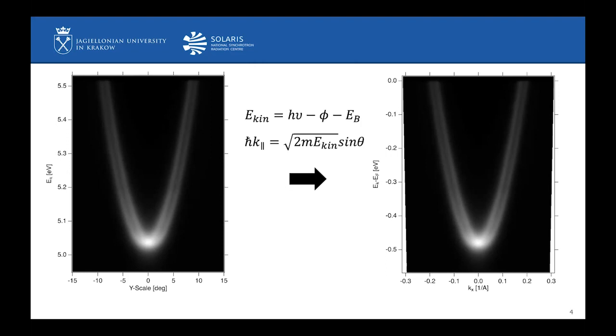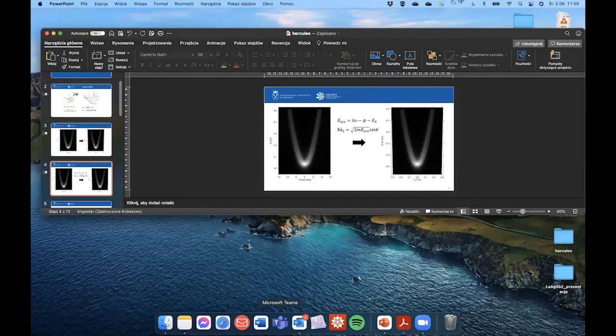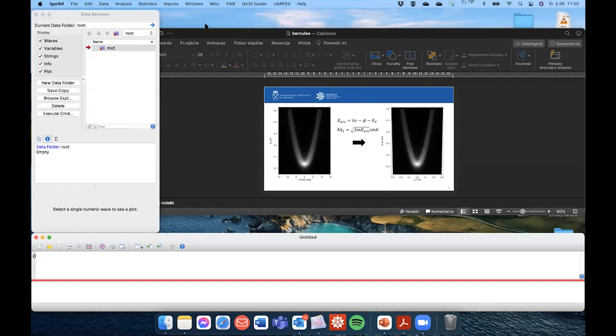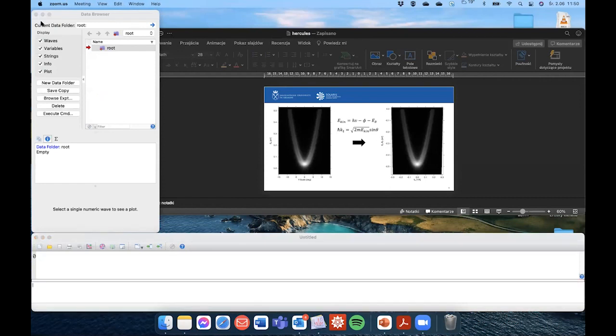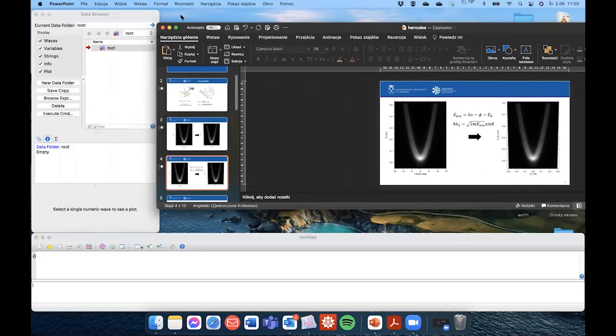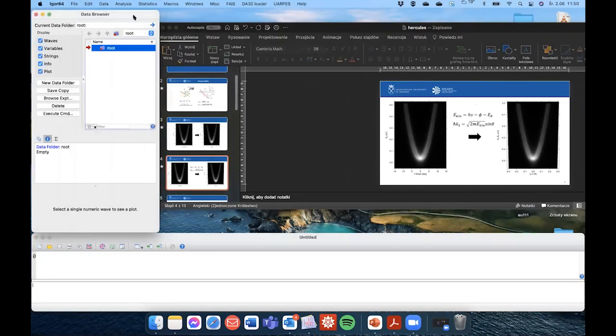Okay, so let's start a more practical part of this talk, and let's launch the ARPES software. Okay, let's minimize that. Okay, I hope you still see my screen. Can you confirm? Yes. Okay, thanks.